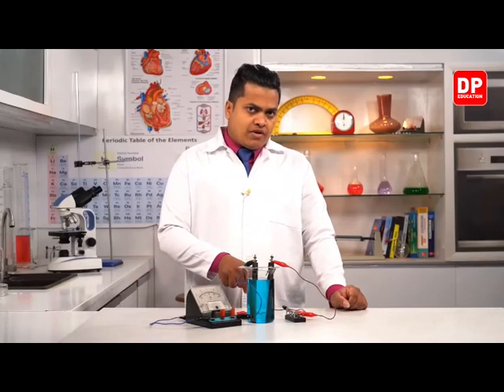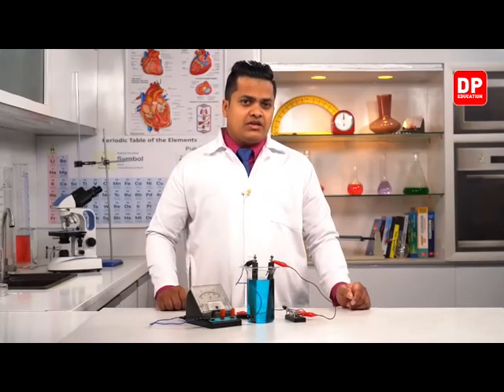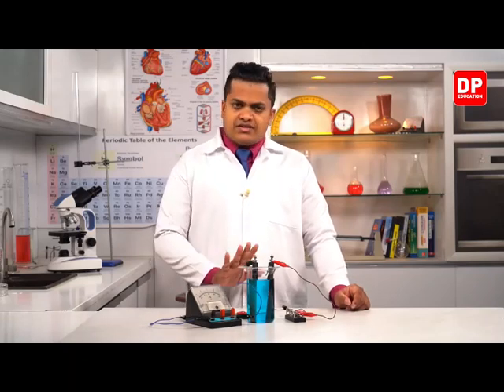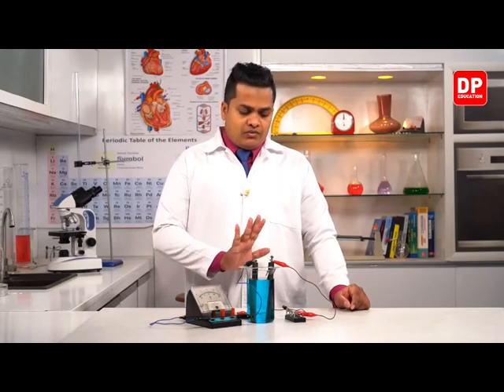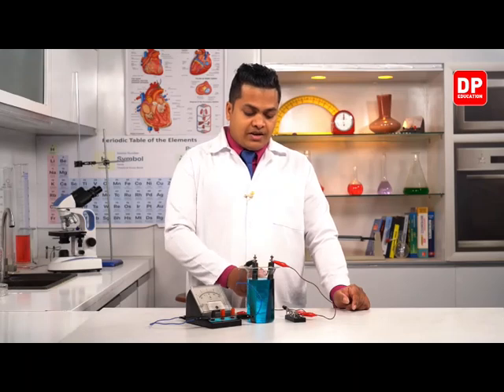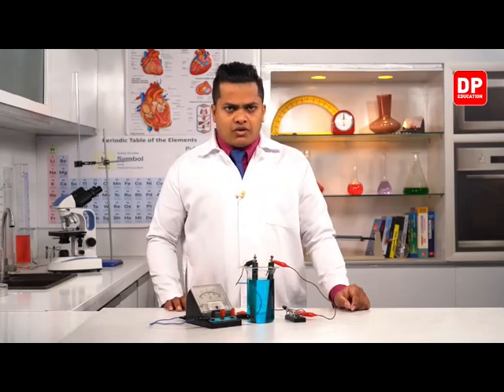Then we are going to check the solution color. In order to observe the color, my dear children, we have to keep the system for a while. So let's keep the system for a while in the same position, the turned on position. As you can see, there are plenty of bubbles now coming out from the positive terminal. So we'll keep it for a while.